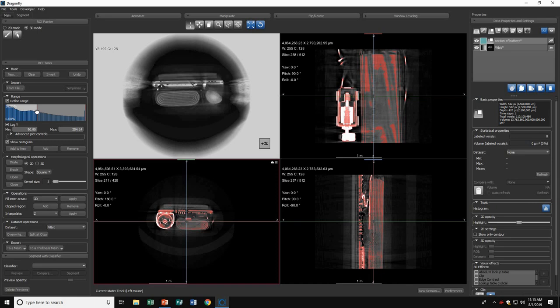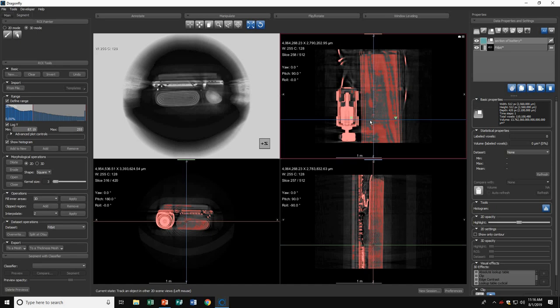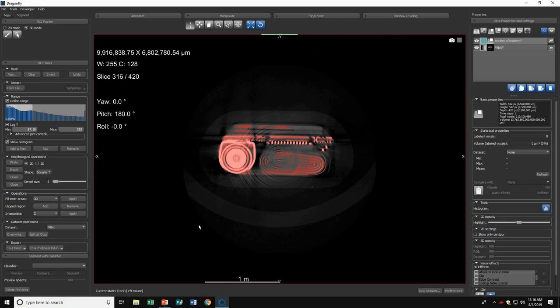That looks pretty good. Now I'll move to the slice I want to look at. I'll highlight this region of my battery and start here. I'll go into 2D mode in my ROI painter. For 2D mode, it only paints the slice you are painting on.